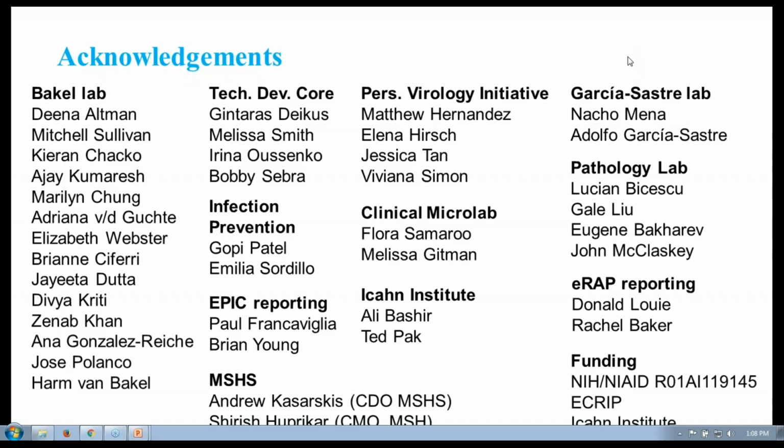Thank you for that. Another question, actually back to you, Harm. Some people feel that focusing on good hygiene practices alone would be sufficient for infection control in hospitals, and that sequencing actually isn't needed. But your program has identified a reservoir of medical equipment that would have been missed by better hand washing alone. Have you uncovered other similar cases like that?